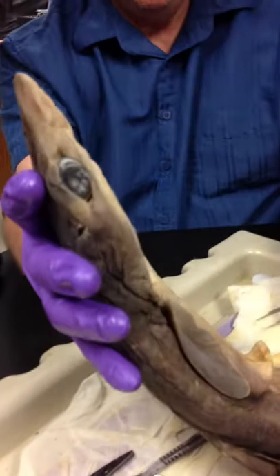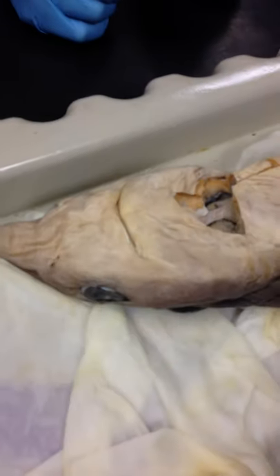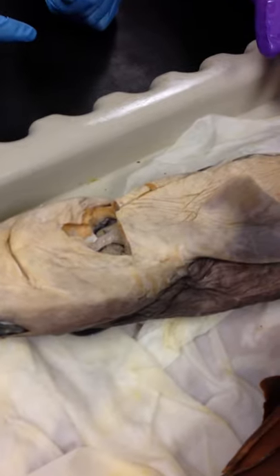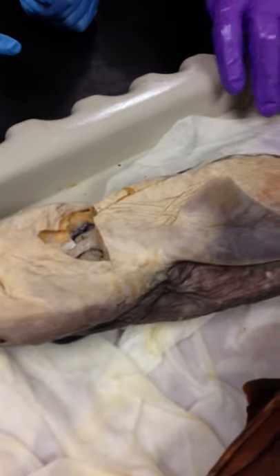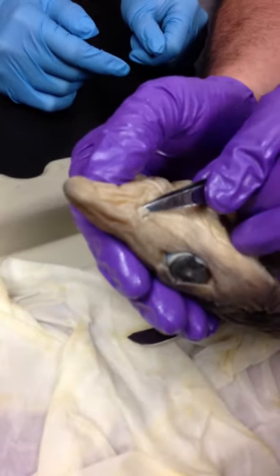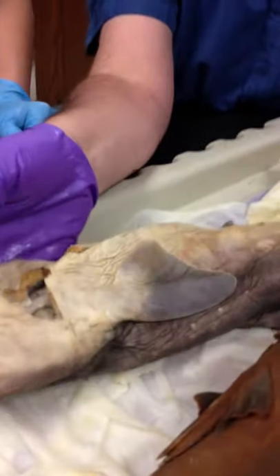There are all like little freckles. And unlike ginger freckles, these freckles have powers. They actually have a sense organ in the pit. It's called the ampullae of Lorenzini, and they're sensitive to electrical fields. Anytime you move an object through a medium that has ions in it, like salt water, you create an electrical current. They can perceive that current. So the shark's swimming along, and there's something hiding underneath, like another fish. It can feel it. They're Jedi. That's a nostril right there. It's got a little flap on it. They don't use their nostrils for breathing, just for smelling. And sharks can smell well, but they don't typically.